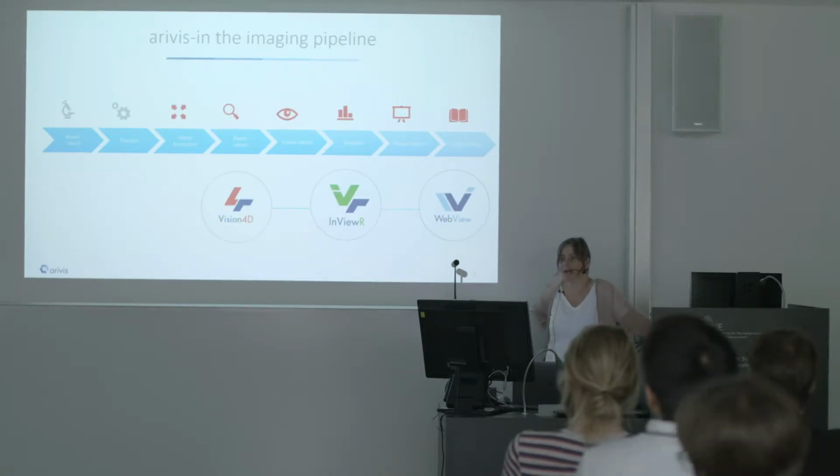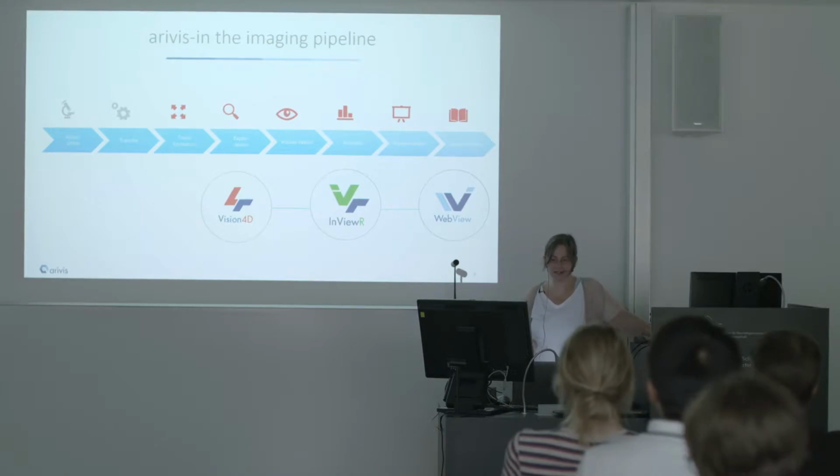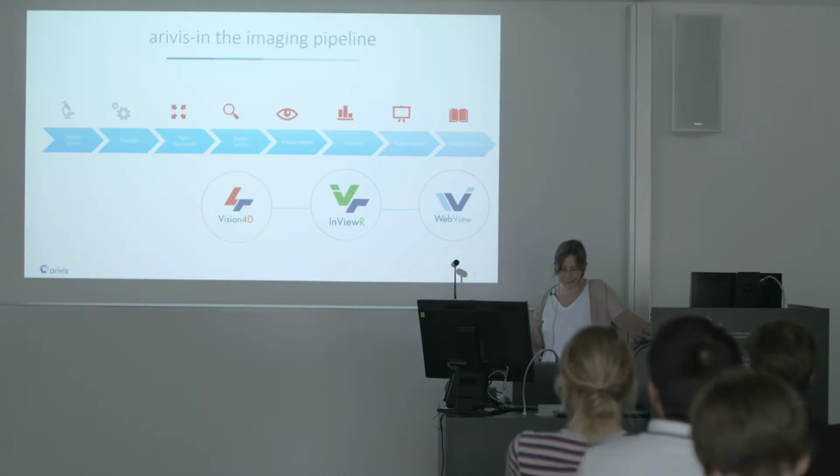Basically, as soon as you have the digitized image and you want to do something with it, you want to look at the data, that's the first thing. It sounds ridiculous, but I'm pretty sure that Mike can tell you some stories about looking at some of the data files which are generated using the clearing techniques, using the light sheet microscopy technique.